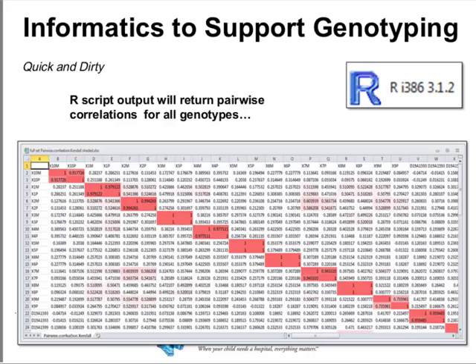And if you format this table so that each of your samples that were submitted with each other, in this case patient X10 where their metastatic as well as their primary tumor genotyping results were in adjacent rows, you see the correlation of the genotypes is very high for those two samples. Next patient pair, same thing. You can kind of walk across this table looking for the correlations.